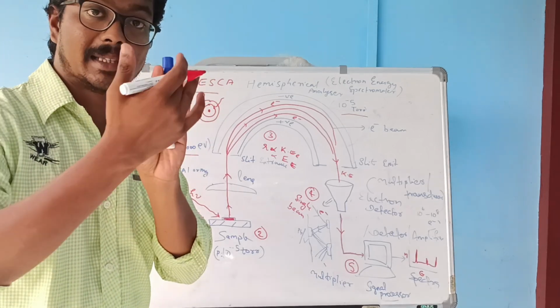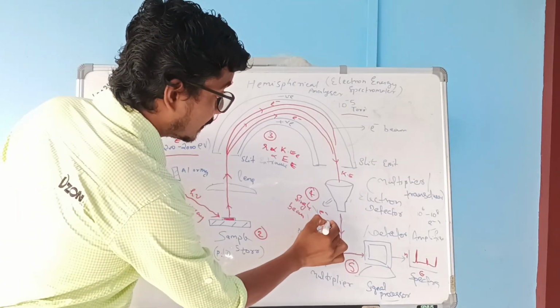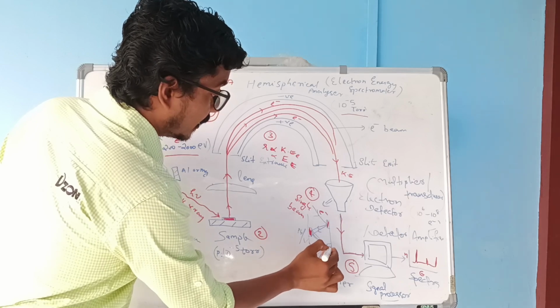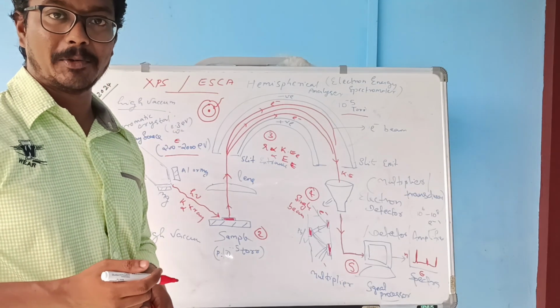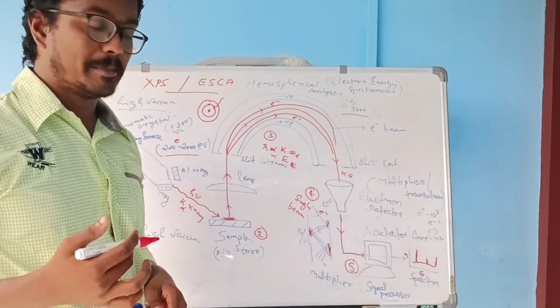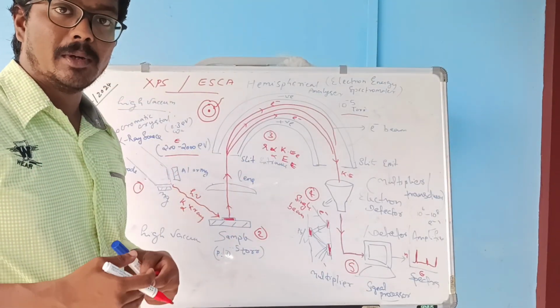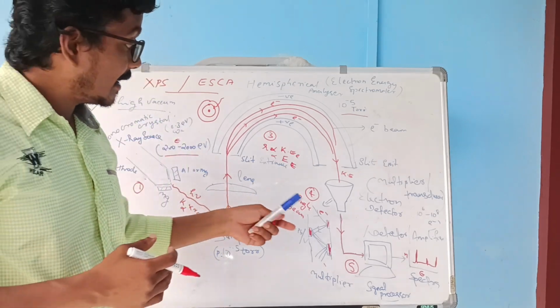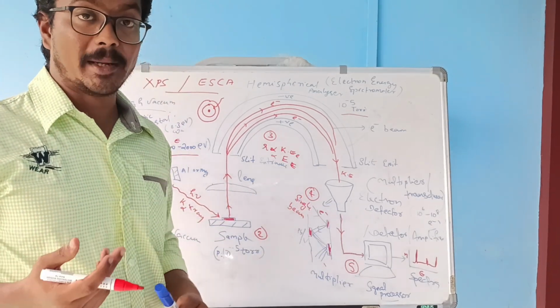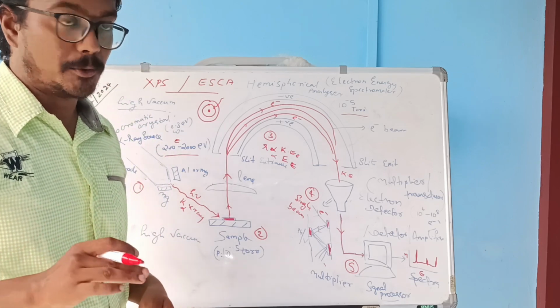The multiplier sides are coated with lead or vanadium metal. This lead or vanadium metal will split the single beam into multiple pulses. As a result, the result will be more prominent and we will get a proper result. Otherwise, the result will be vague.